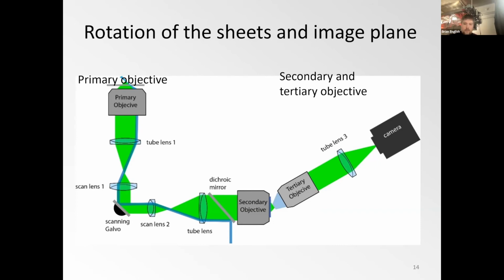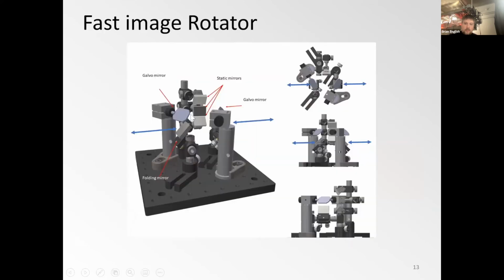I think fundamentally there is this thing called the optical étendue. If you create a different magnified image space, you also change the angular range, so the divergence. So even though you could demagnify the image on these mirrors and say, okay, that way we increase the field of view, you increase the divergence of the image forming rays, and then they get clipped on these mirrors by divergence.